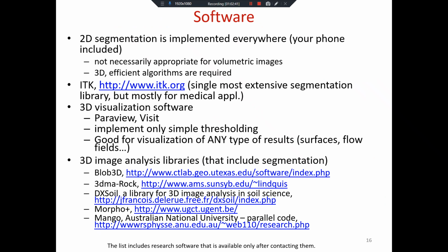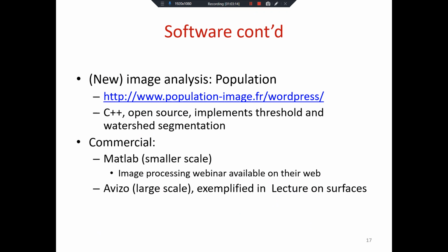The moment you give it this value, that's thresholding the pressure at that value and just visualizing the surface in between. We're going to get to visualizing surfaces next, but this simple thresholding or isocontouring is built into most of the visualization software. So software is there now. We're going to focus on what's found in ImageJ for the purposes of this.